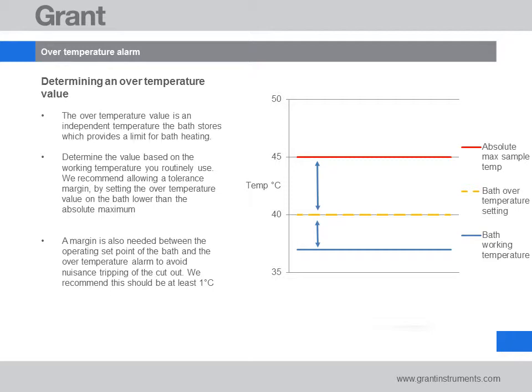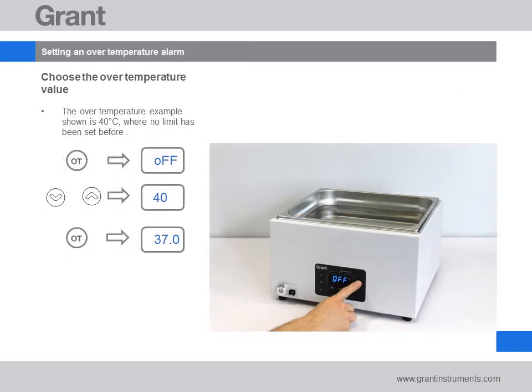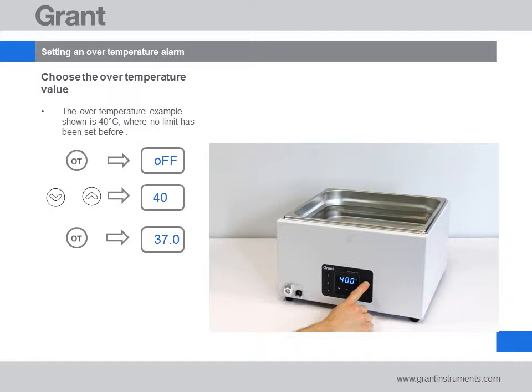Grant recommends this margin is ideally greater than 1 degree C. In our example we set an over temperature alarm to 40 degrees C. Press the over temperature alarm key. If this is the first time the alarm has been set, the display will show 'off'. Use the arrow key to select the over temperature limit you would like to set — in our case, 40 degrees C. Press the over temperature alarm key to save it. The alarm is now set and the bath will show the water temperature.